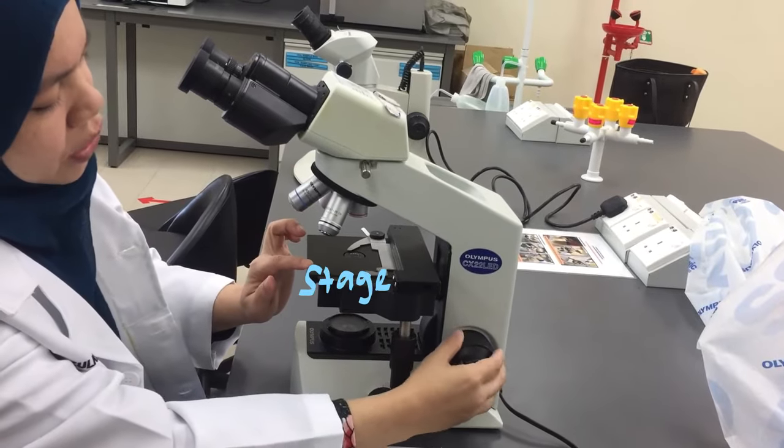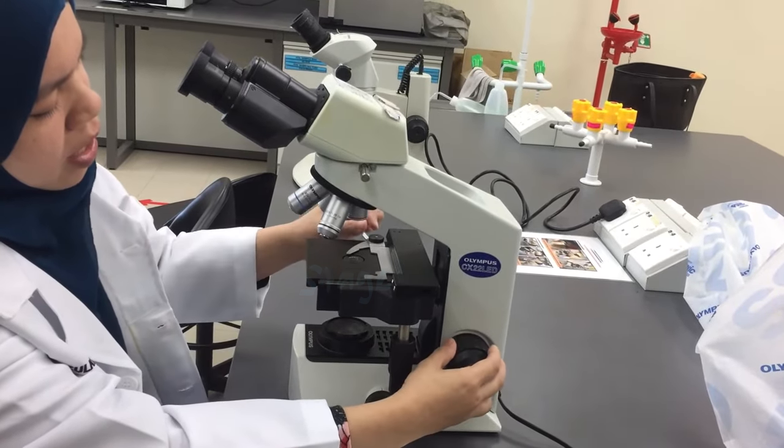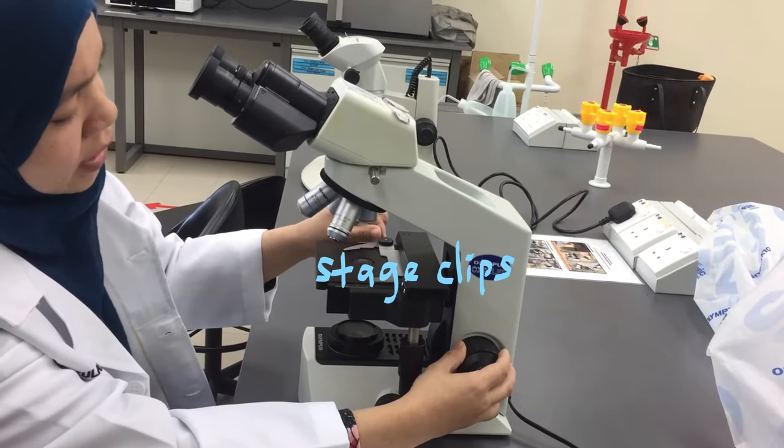You have here the stage and the stage clips to hold the slide.